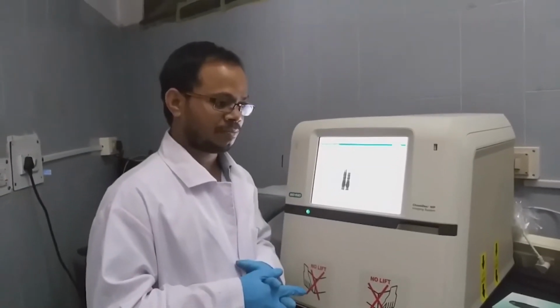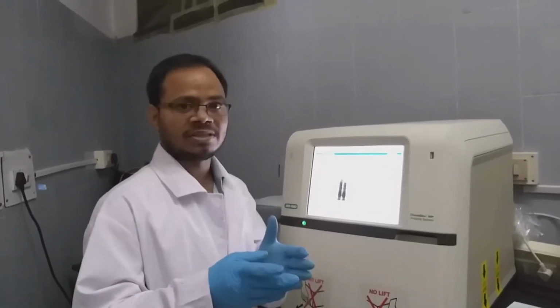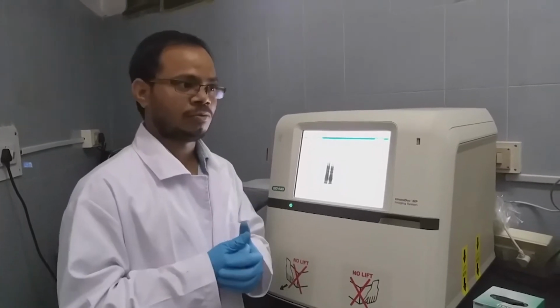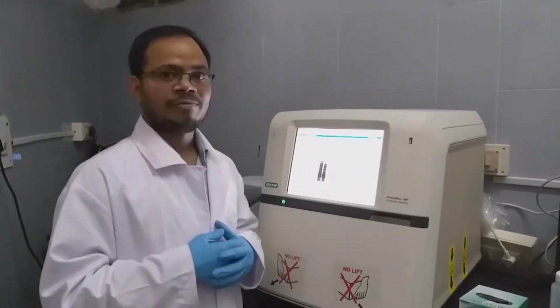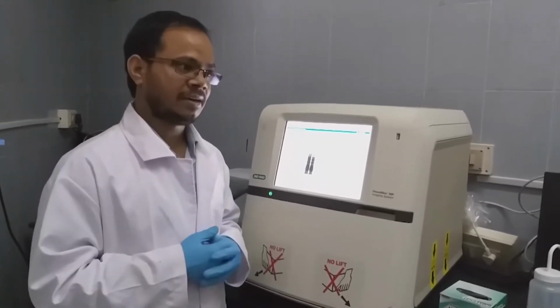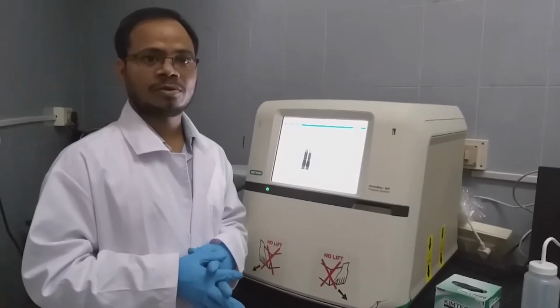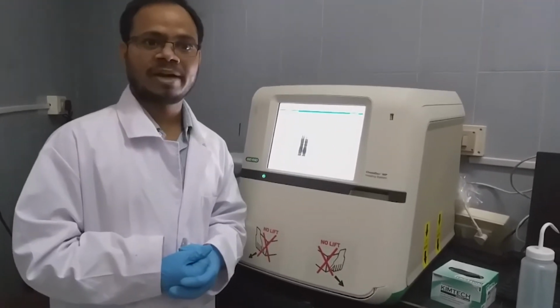Contaminants sometimes may come because 3 or 4 histidines in the folded state give the possibility to bind to the nickel NTA column. Also, vigorous washing should be done. If you don't wash properly with a high amount of imidazole, that will give you this kind of non-specific binding.